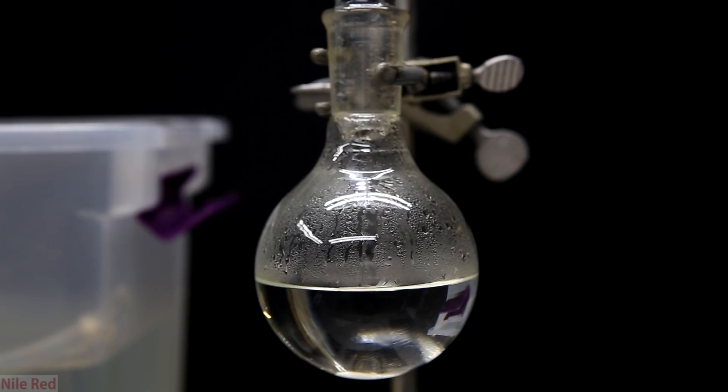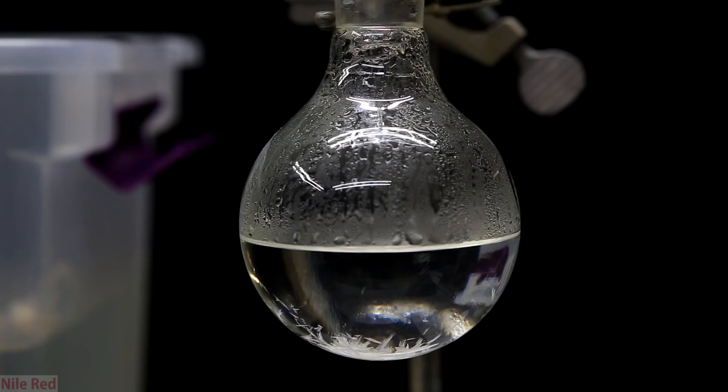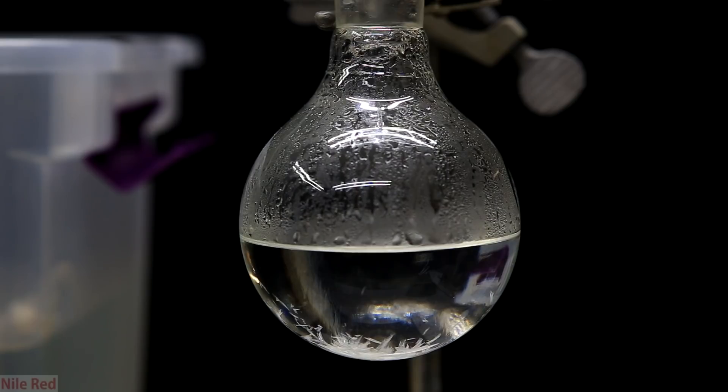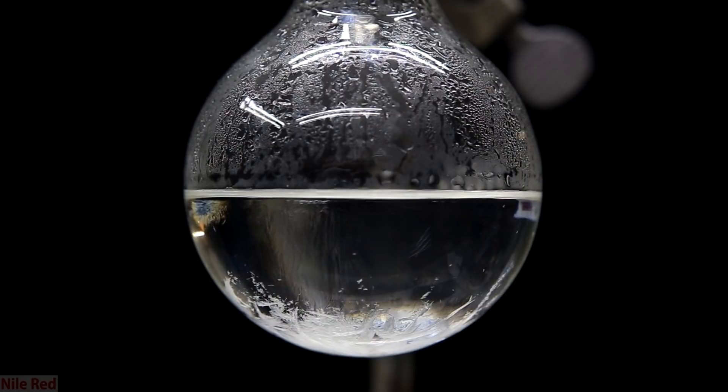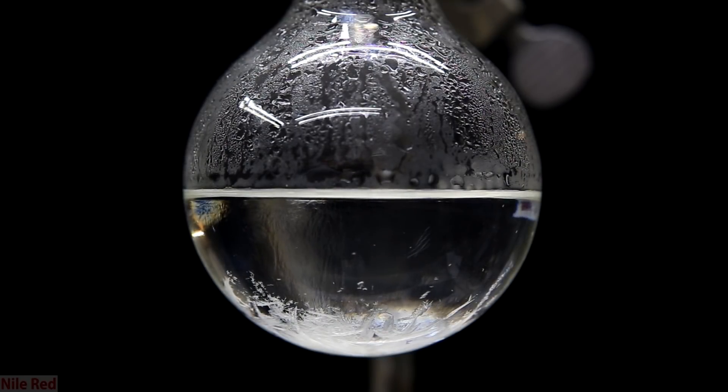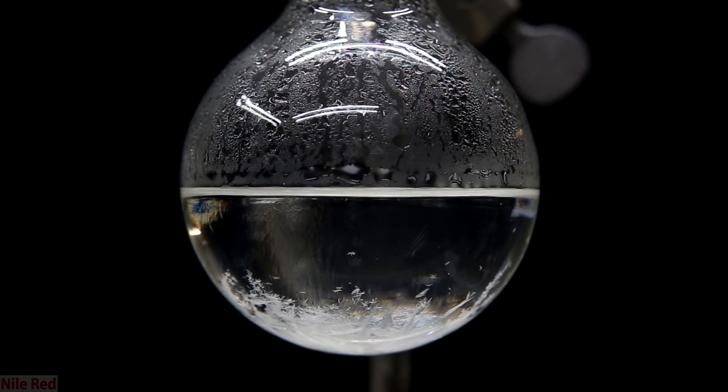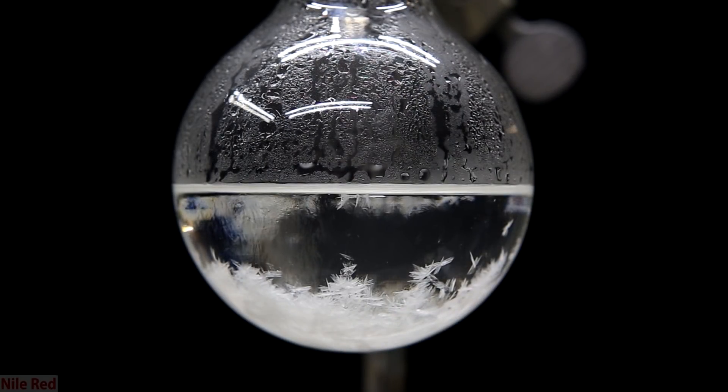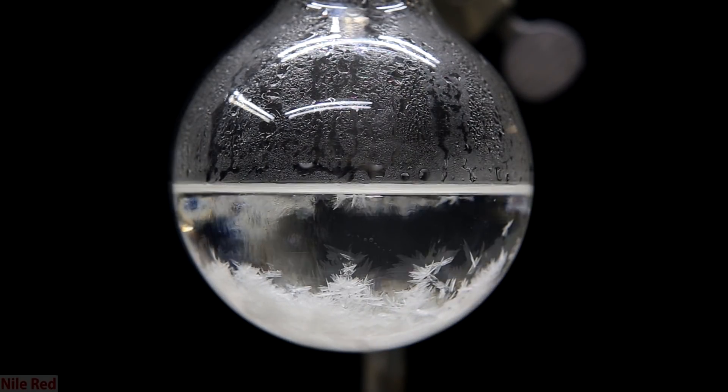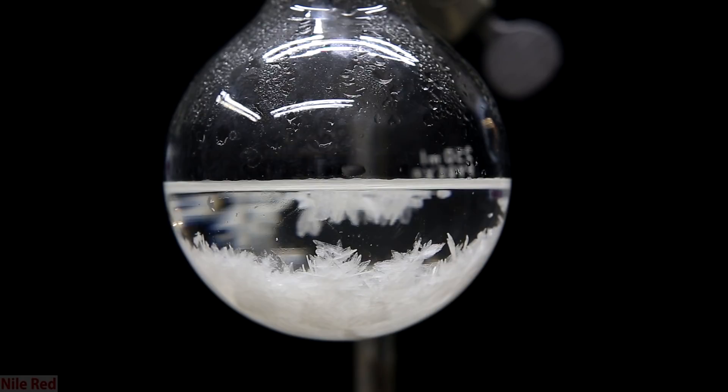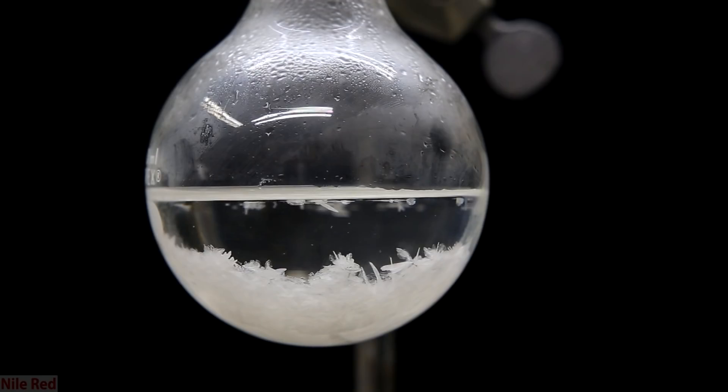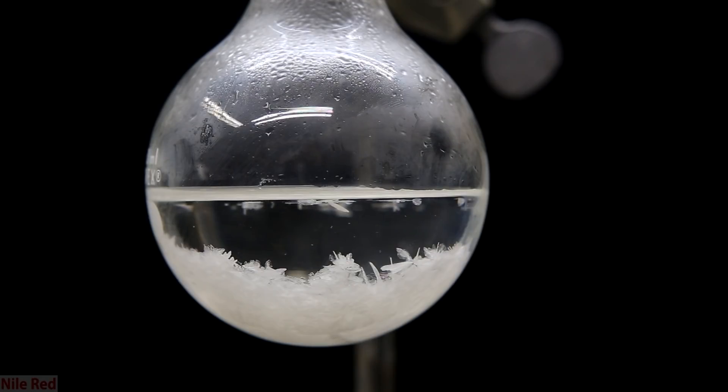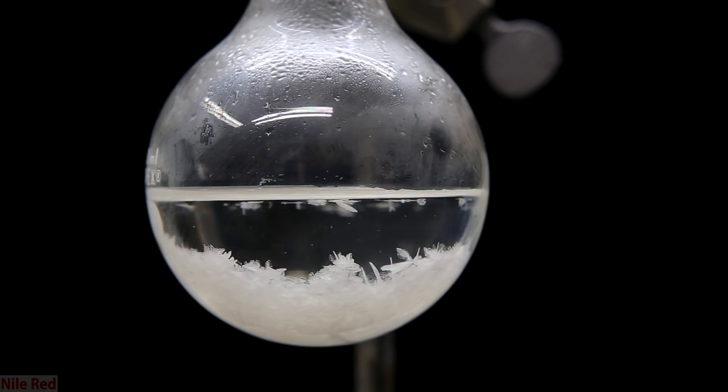After the 20 minutes has passed it's removed from the oil bath and allowed to cool to room temperature. We allow the solution to cool slowly and as it cools some crystals will form at the bottom. As time passes more and more crystals form. After the solution has reached room temperature there's quite a few crystals. To precipitate as much as possible the solution is placed in the freezer for several minutes.